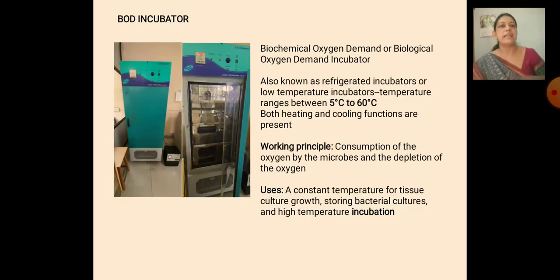The next one is the BOD incubator. Now the term BOD means biochemical oxygen demand or biological oxygen demand incubator. And what is this? That is the amount of oxygen that is utilized or depleted by a microorganism or a bacterium. And this is also called a refrigerated incubator or a low temperature incubator.